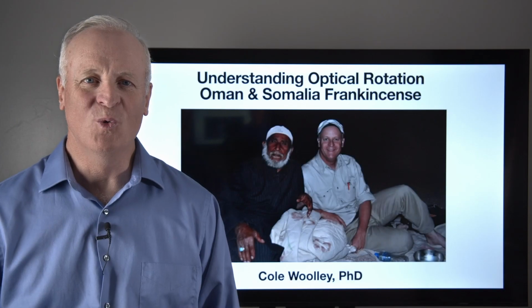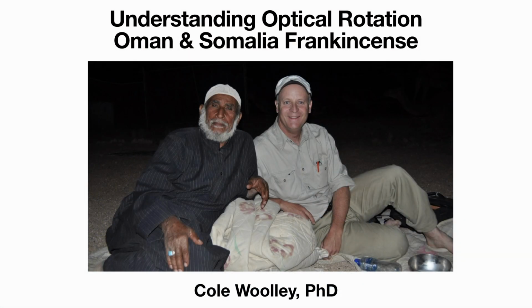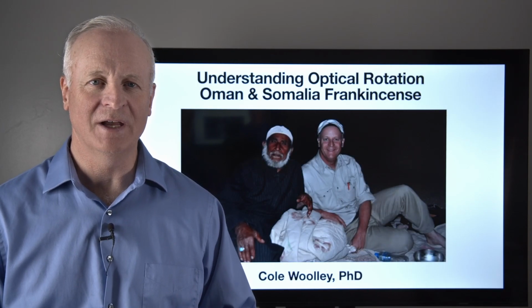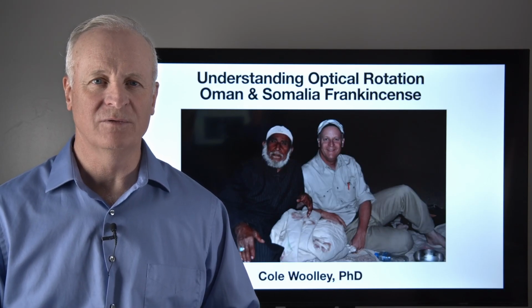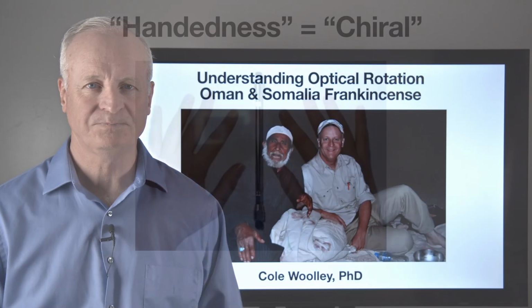Hello, this is Dr. Cole Woolley, and this lesson is called Understanding Optical Rotation. I'm going to use a different analytical test to help me differentiate between Oman frankincense and Somalia frankincense. Let's look at optical rotation.